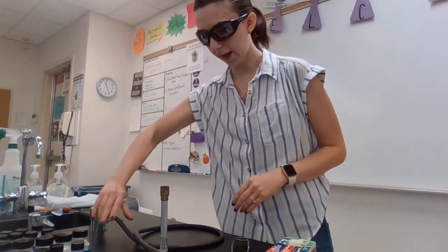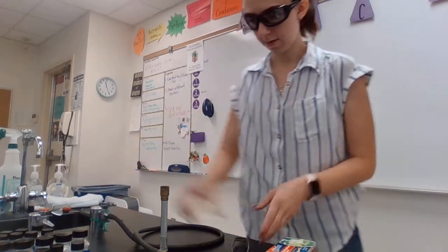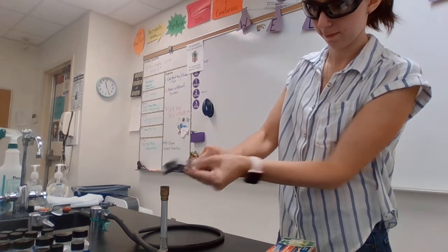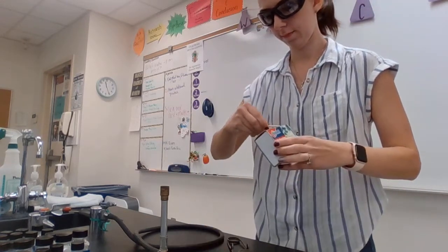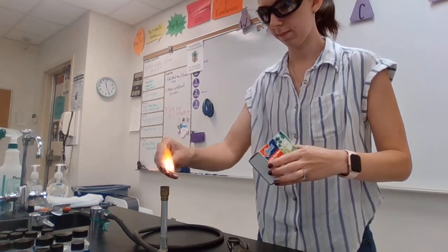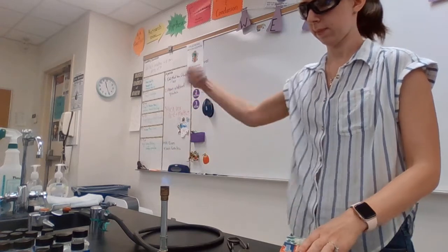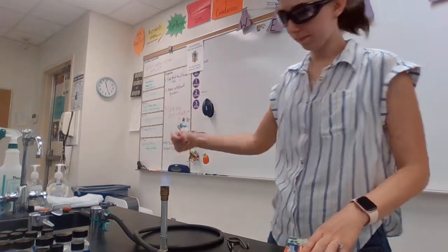So we're going to go ahead and turn on our gas. And we have our flame.